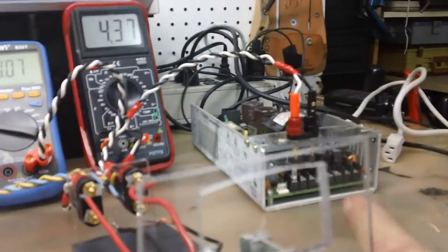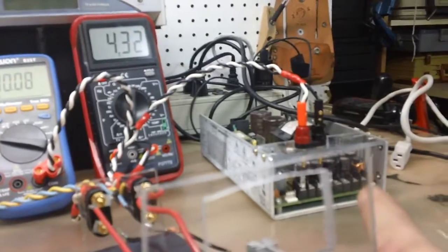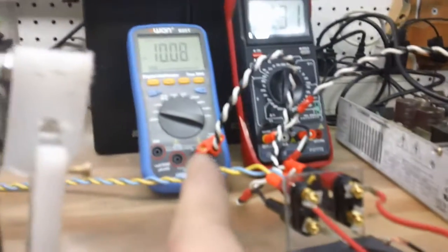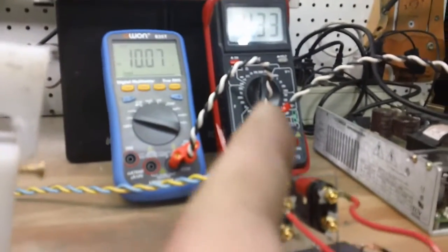What I have here is a power supply rated at 24 volts at 10 amps, and that's running through a PWM. You can see it's 10 volts and about 4.2 amps. That goes up as the water heats up and as the sodium sulfate gets into the surface of the graph oil.